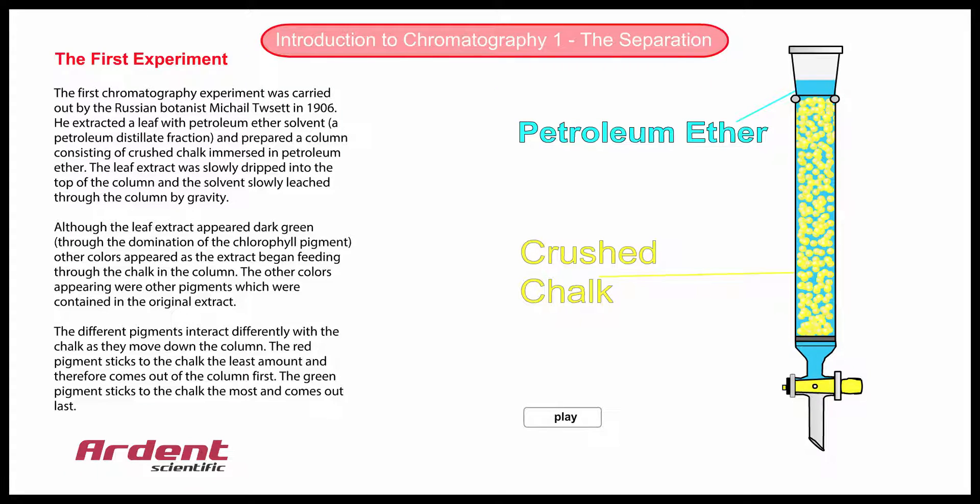To begin with, we drop a solvent leaf extract with a dropping pipette into the top of the glass column. The leaf extract is a dark green colour. This extract contains a mixture of coloured components, and as the stopcock is opened, the liquid runs through the column, and the coloured components move through the column and appear as coloured bands.